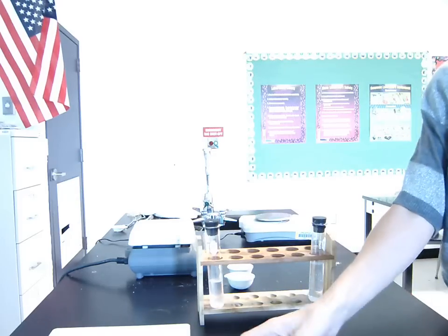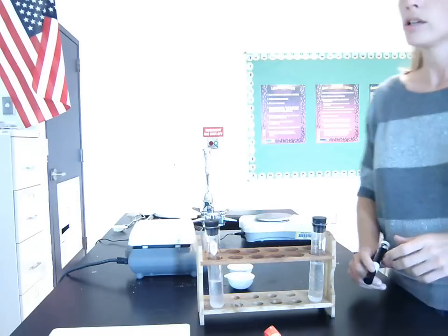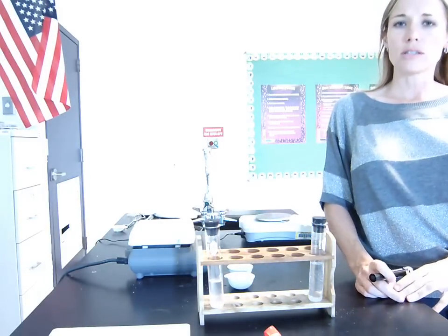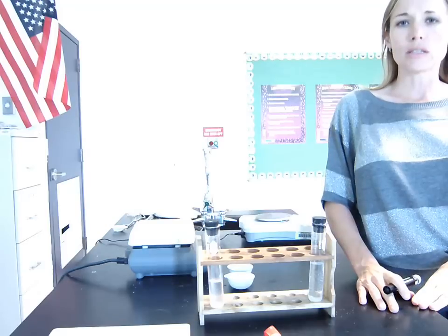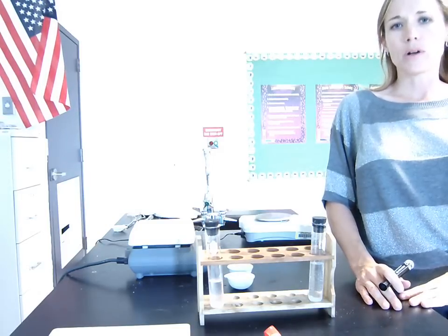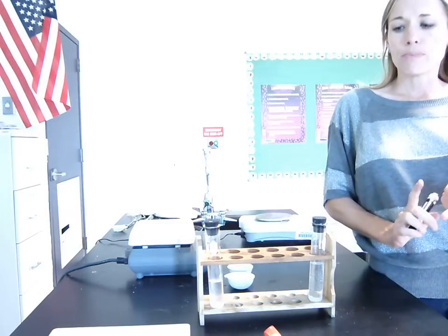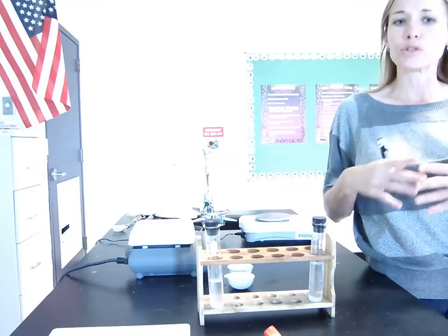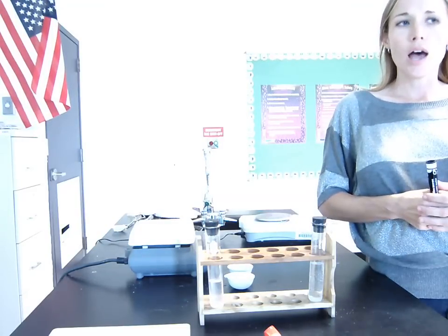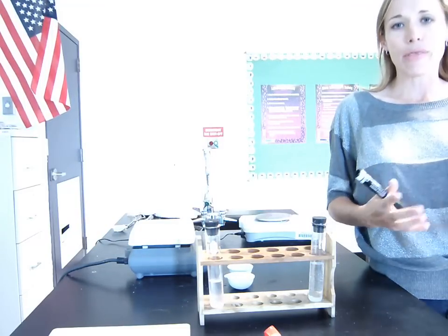Alrighty, this lab is lab 4.3, comparing the concentrations of saturated solutions. There's two things that make this lab a little bit on the complicated side. First is just procedurally, it takes some time to get through all the stuff we've got to do. The second thing is the math.